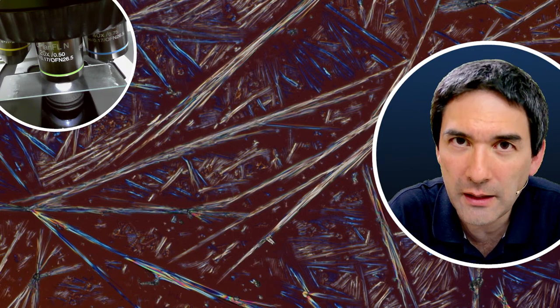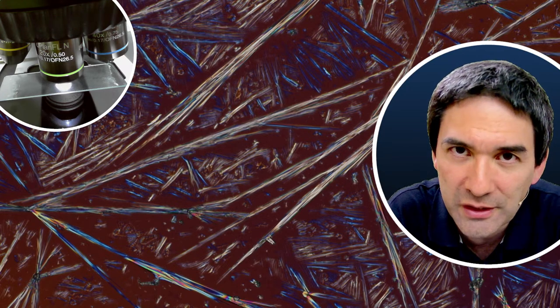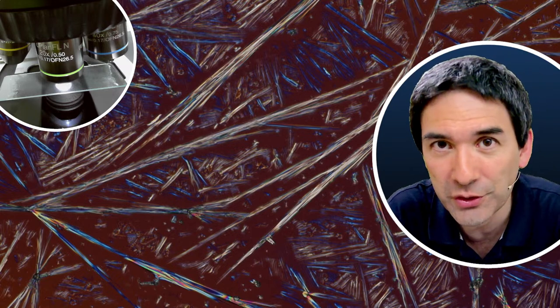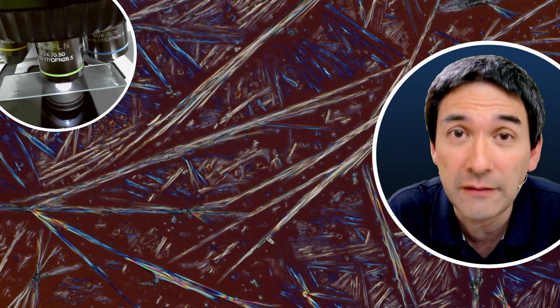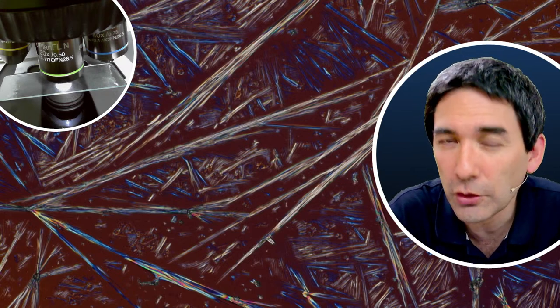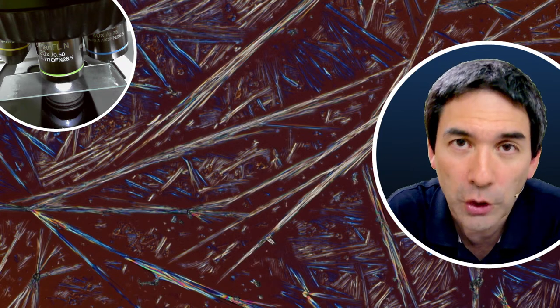First of all, as always, it depends a lot on the actual substance in use, but indeed the speed of crystallization can essentially have an effect. Temperature can have an effect, impurities can have an effect on how the crystals look, the initial concentration can have an effect. Because there are so many variables involved, I would not be surprised if indeed the solvent also has an effect.